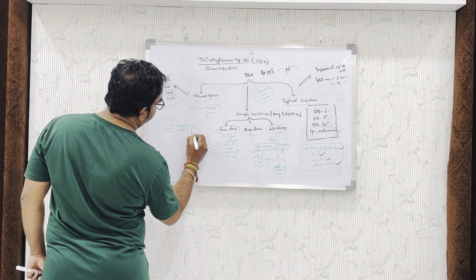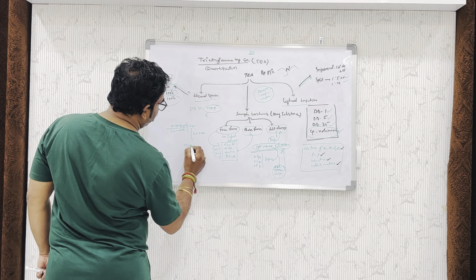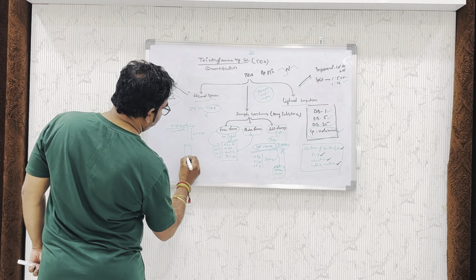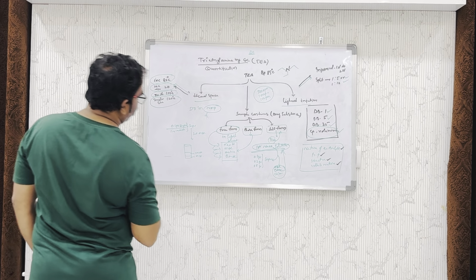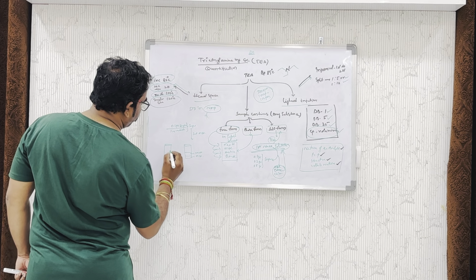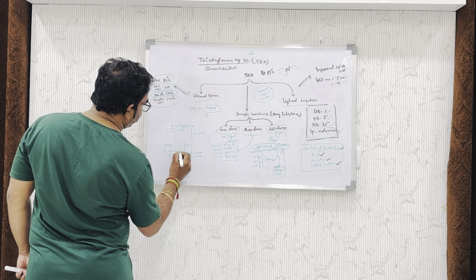Then you can add 3 ml of MDC. Now the layers, for example, can be taken in a glass tube or centrifuge tube or separating funnel. These are the 2 layers. That one is the NaOH layer, the upper layer. The lower layer is MDC. If you extract with ethyl acetate, this is the NaOH, that is ethyl acetate. This is the upper layer.